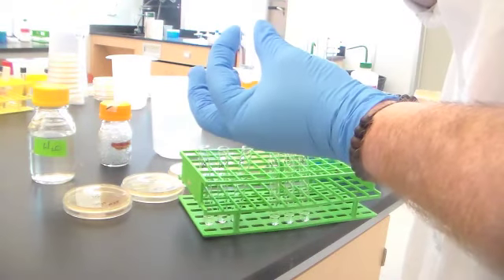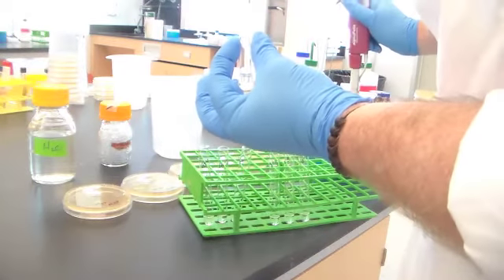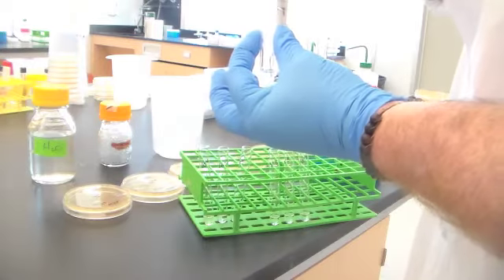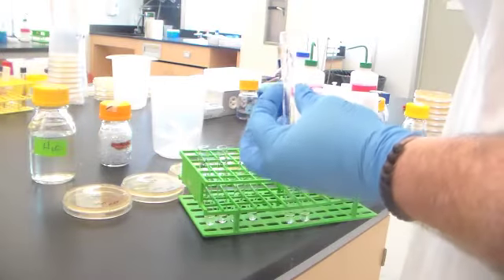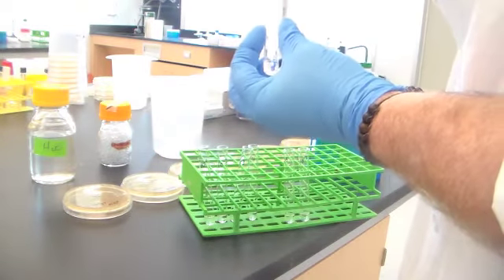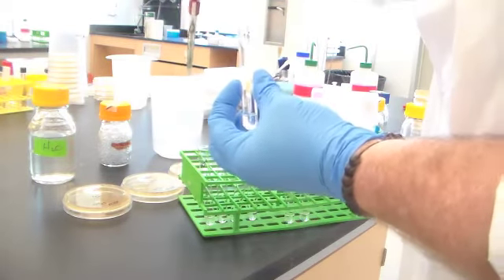Did you change the pipette tip? There's lots of ways that you can make an error as you're doing this. So it's important to stay focused. Even as I'm talking to you right now, I'm beginning to think, have I made a mistake? Did I forget to change pipette tips? So I'm just going to do the rest of this in sweet, blessed silence.